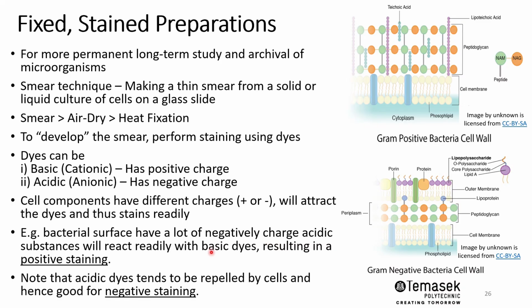They're negatively charged, the basic dyes are positively charged. They will come together, resulting in a positive staining. All right, so note that some of the acidic dyes, which are negatively charged, tend to be repelled by cells, and hence they are very good for negative staining.